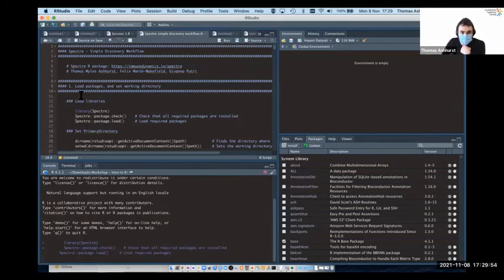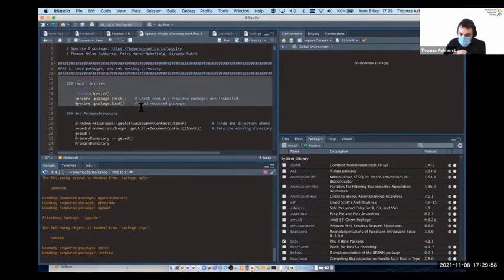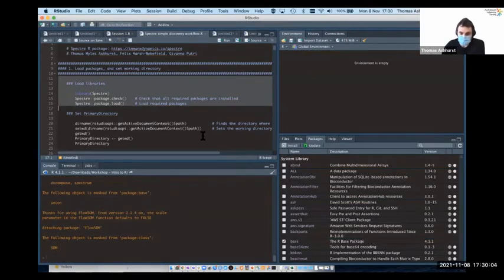These first steps, typically of all our workflows, start with loading the libraries that we're going to need. These are the actual packages that we're going to rely on for the analysis, which is very important. Once we've loaded the libraries, then we typically will move on to pulling the data in so that we're able to get on with our analysis, so to speak.